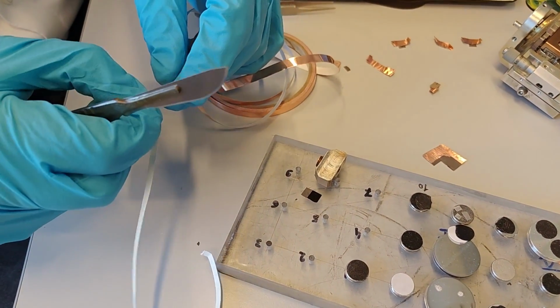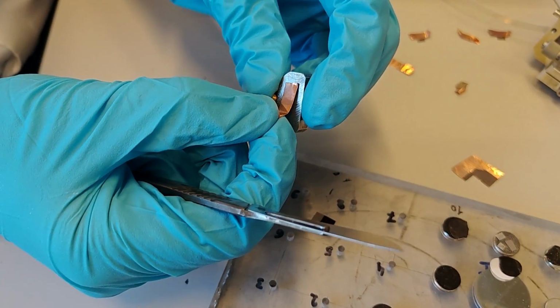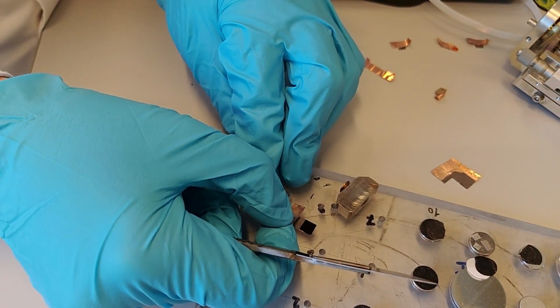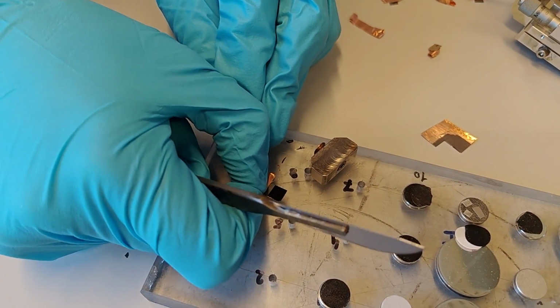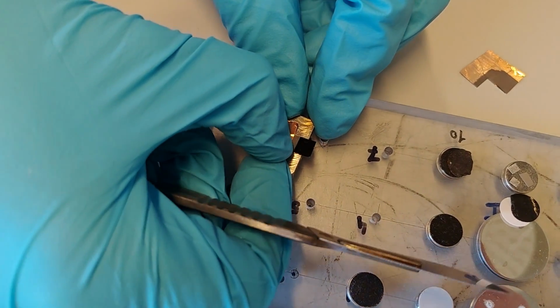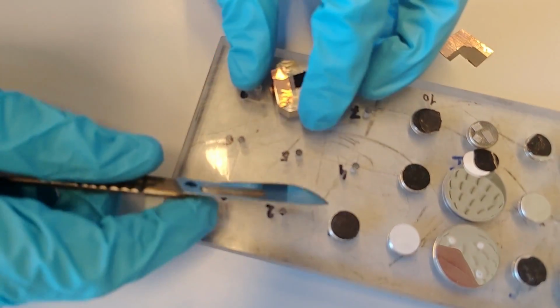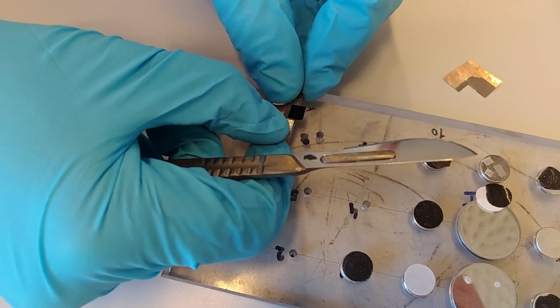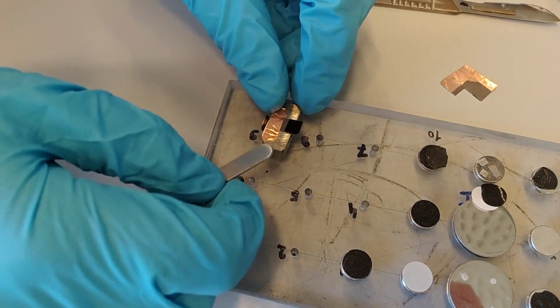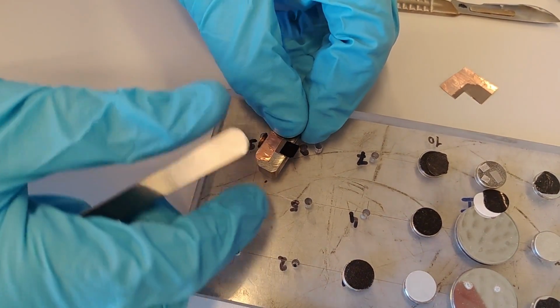The width of the tape here, or length of the tape, should not be longer than the back piece. So it should be on the inside of the area here. So put the tape here on the bottom of your material, like that. And put the tape on the bottom part here. Take the back side of my tweezer and press here so it comes together.